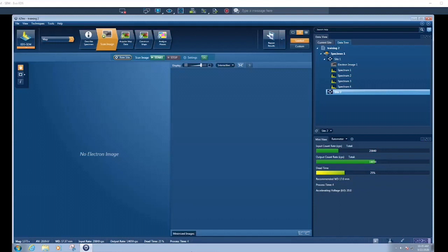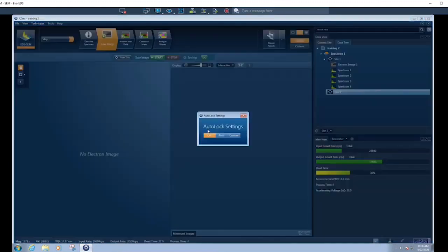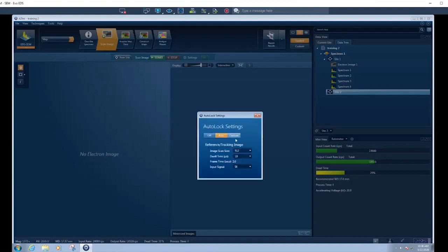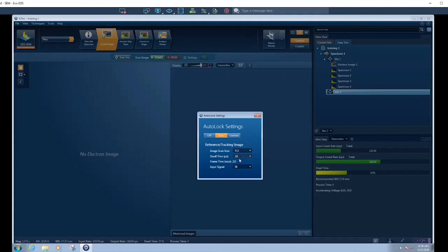So we're going to start the new site image and collect an image for this area. We're going to go to settings, keep the same resolution, keep the same dwell time, but we'll turn on drift correction. Go to auto lock settings, turn it on auto. You want to aim for about half the resolution of your normal image and a dwell time similar to what you find, so there's enough signal, because basically it uses this small image to track. After each scan, it will use this reference image, take another quick image in between collecting the EDS spectrum, and look at any features that have moved and try to move the beam to compensate for that.